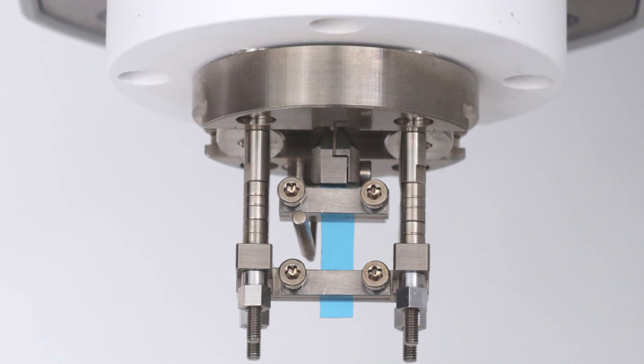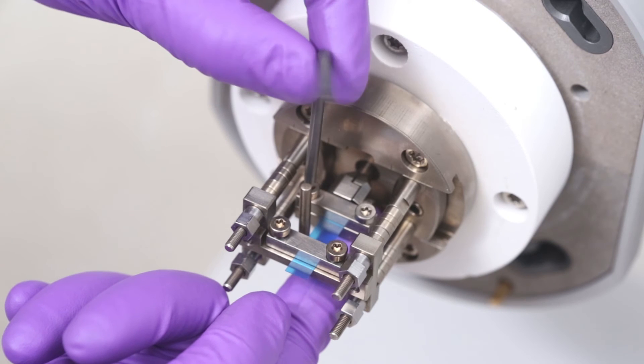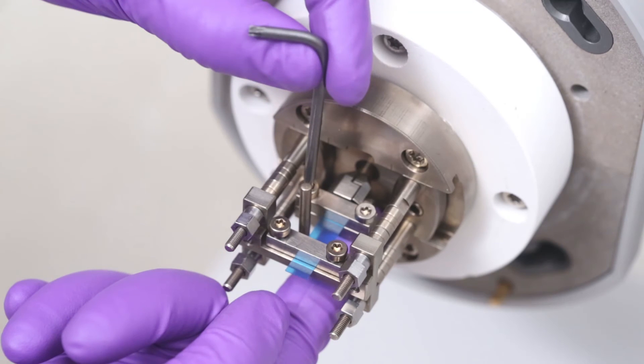Once you are happy with the positioning, tighten the two screws on the driveshaft part of the clamp using the T10 Torx key. While tightening the screws, support the driveshaft part of the clamp with your fingers. Be careful not to cause unwanted clamping effects on the sample.